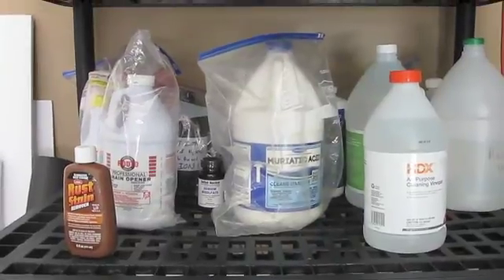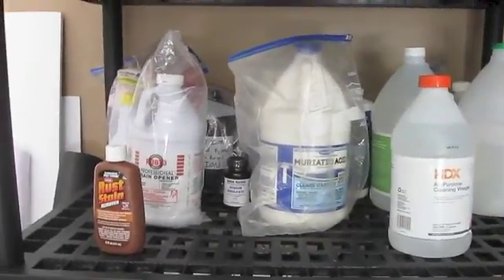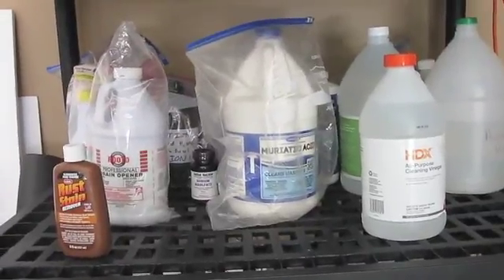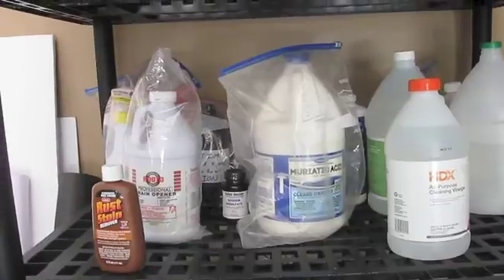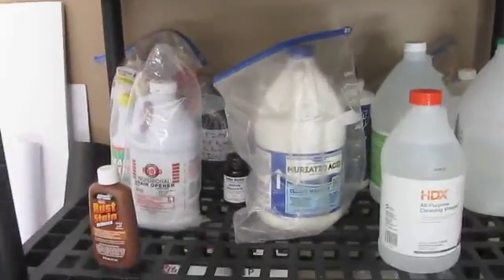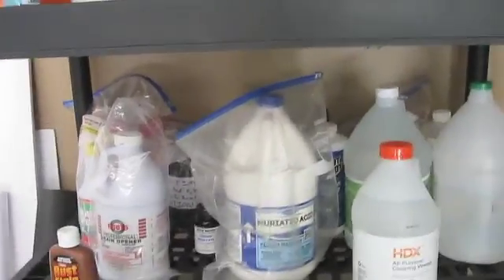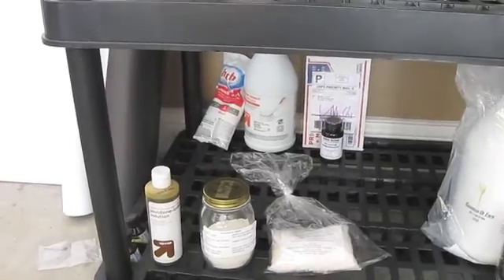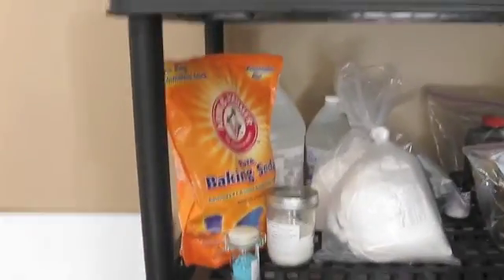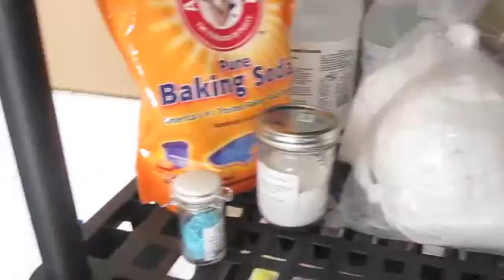When I was cleaning out my other shelf, I actually noticed that I had been storing hydrochloric acid right next to bleach, and then the bleach right next to ammonia — that's two opportunities to generate chlorine gas. Now I can avoid that because hydrochloric acid is right there, bleach is right there, and ammonia is up here. And speaking of up here, this shelf is bases and carbonates.